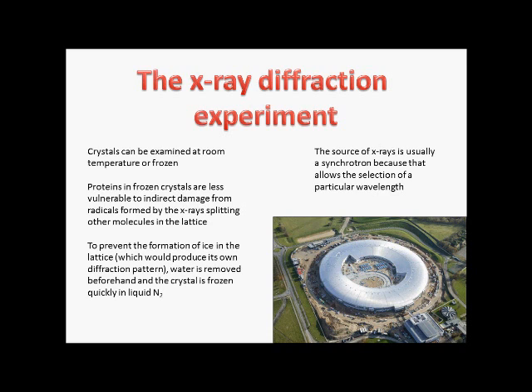If you do this, you have to make sure you freeze your sample very quickly using liquid nitrogen. And this is because if you freeze water slowly enough, you form ice. And since ice is also a crystal, it would have its own diffraction pattern.